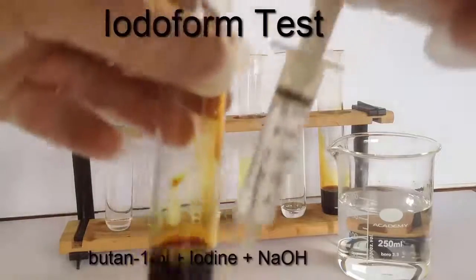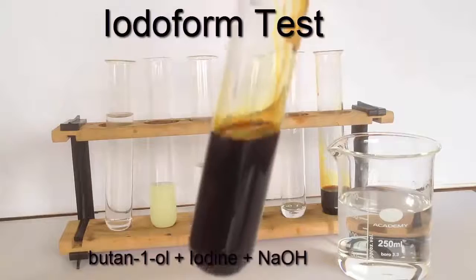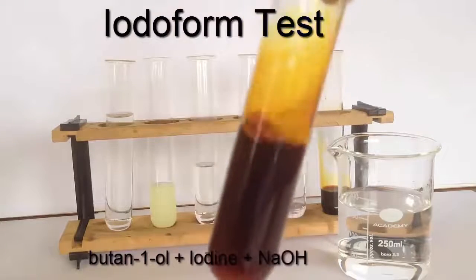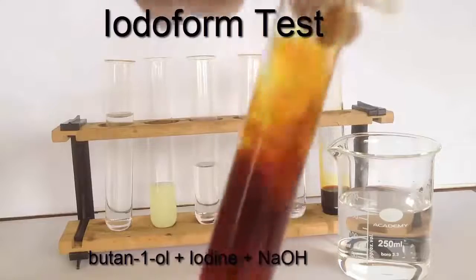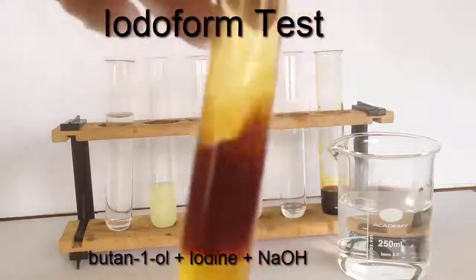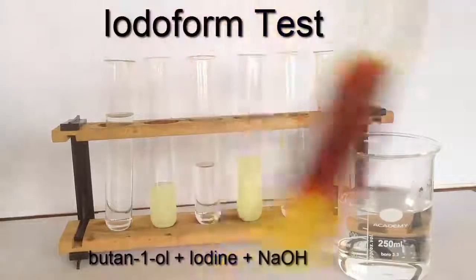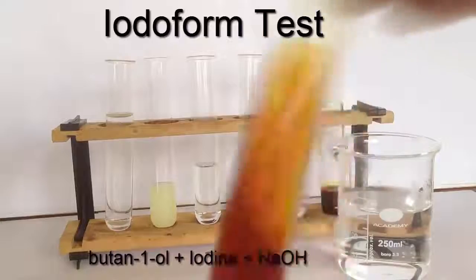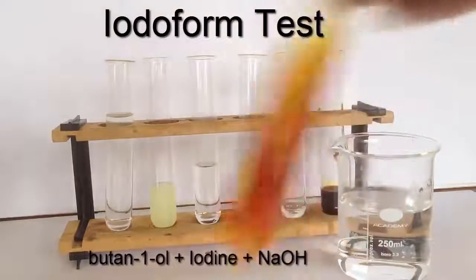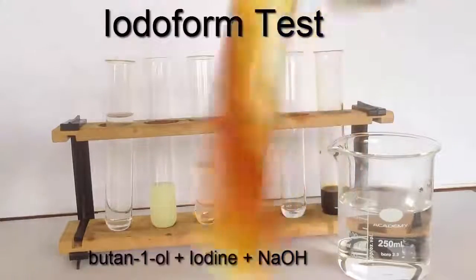So here I've got the last one, butane 1-ol. Consider its structure and whether you expect this test to be positive or negative. So I've added about 1.5 times as much 10% iodine solution as alcohol, and I'm now adding 2 molar sodium hydroxide solution slowly with shaking. The butane 1-ol is a bit more viscous and takes a bit more shaking here. The color is fading.